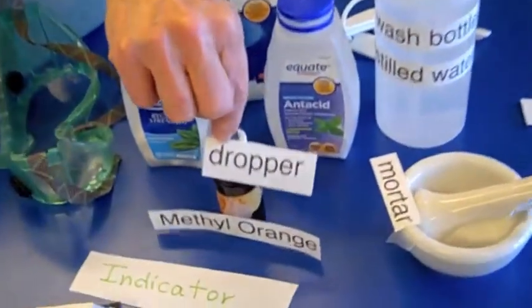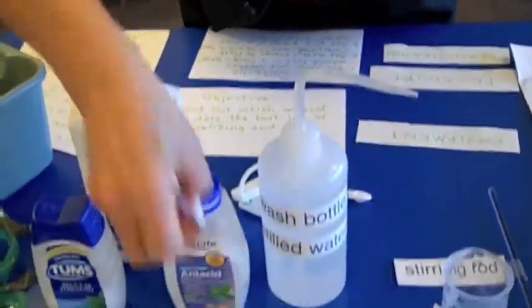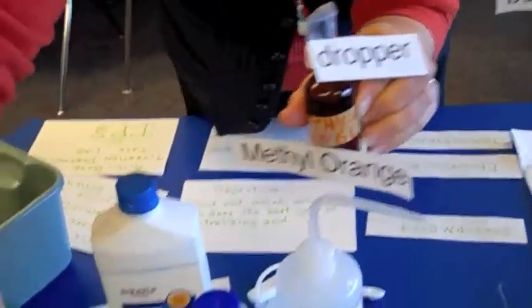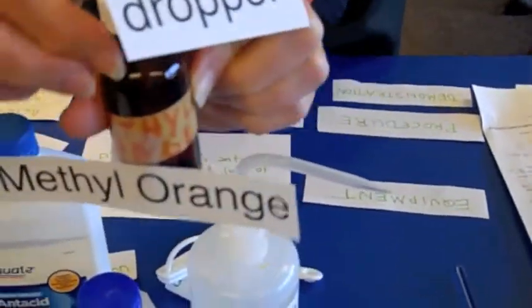And you will need some methyl orange and a dropper. The dropper is just an eyedropper. The methyl orange is the name of this indicator. Now, in this case, this is an indicator. This tells you when a substance has gone from base to acidic. It does not tell you when something's neutralized. It tells you when something is acidic, by turning pink, a bright pink.